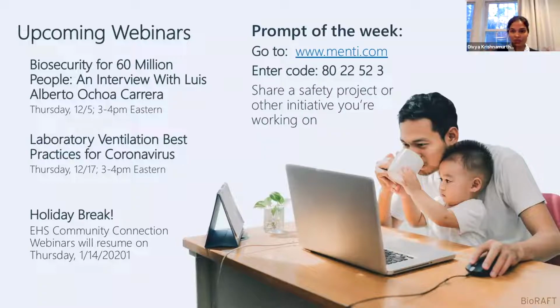We get a lot of questions like, I have this disposable lab coat, where does it go? In terms of PPE disposal, unless it's come into contact with something that's truly hazardous, we don't dispose of it in a waste stream. And the other thing, again with respect to PPE, and this might be a bit of a tangent, is that a lot of these items, like disposable lab coats, are in shortage. So we're stressing the reusable, at least for lab coats, going that direction. I don't know if this answers your question, but we've been focusing more on waste minimization strategies, which now we just have more time for.